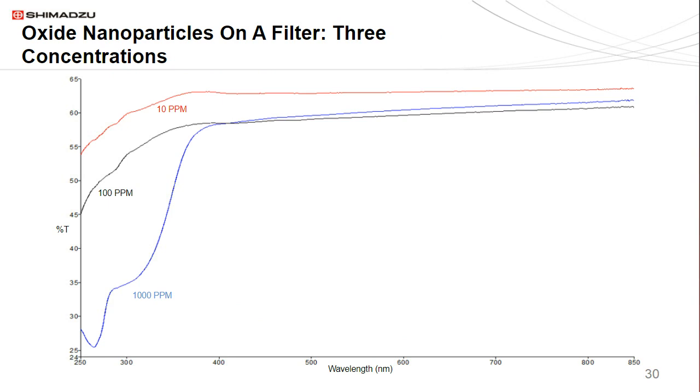So now we get to the important stuff. Most industrial applications of nanoparticles do not have nanoparticles floating around in solution unless you're doing wastewater analysis or pollution analysis or something like that. Most industries are placing nanoparticles into products, be it fabrics, paper, creams. The nanoparticles are in some sort of product. So can we detect the nanoparticles in something other than a solution?